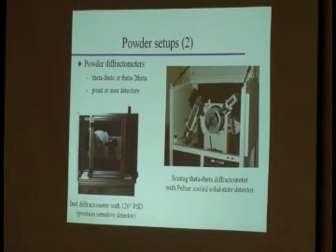Theta-2-theta means your sample moves by theta, your detector by 2 theta, and your X-ray source stays fixed. What's the advantage? Well, you don't have to move an X-ray source. So mechanically, that's easier. What's the disadvantage? Well, if you run a powder sample and you start tilting it, if the powder isn't sticky, guess what? It'll fall off. Okay?